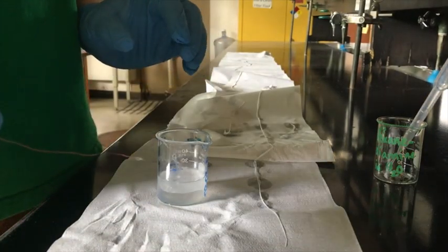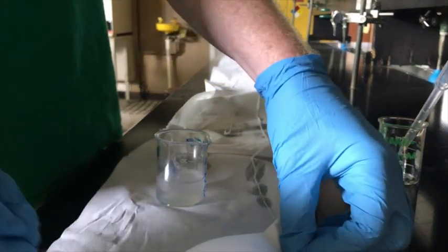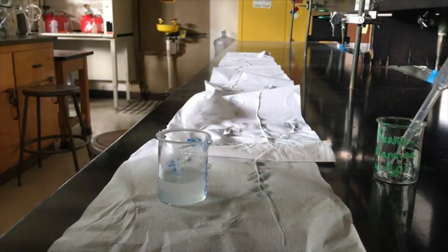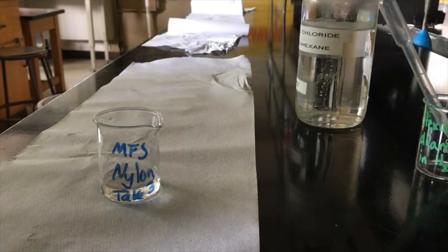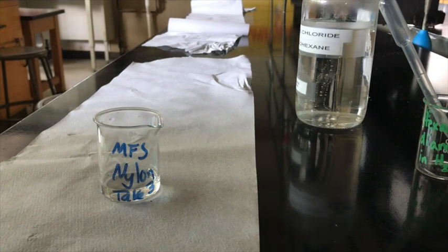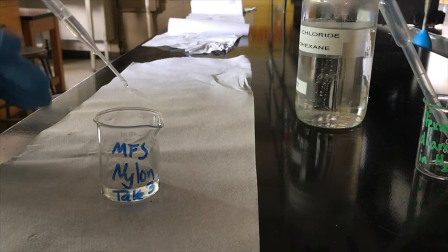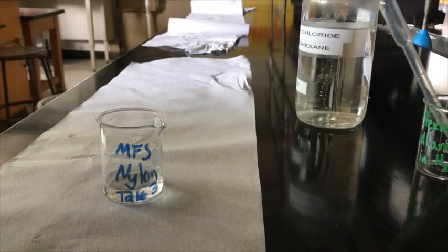Oh shoot, I didn't add the base. This is awesome. Yeah, I made a mistake and we're gonna learn from it. All right, now to do it correctly, I've added my aqueous 1,6 hexane diamine, and I'll make it basic before I add the organic layer. So I'm gonna go 1, 2, 3, 4, 5, 6, 7, 8, 9, 10 drops of the 20% sodium hydroxide.